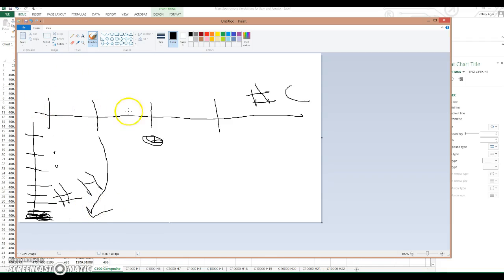In review, we have our carbons here, we have our protons here in this nice little sliding graph. We don't populate the whole matrix because it's not reasonable for things with 10 carbons to have a bunch of protons, nor is it reasonable for something with 1,000 or 10,000 carbons to have 3 protons. They just won't. Turns out it is reasonable for them to have 1 proton because there's a kind of mass spec that does that.